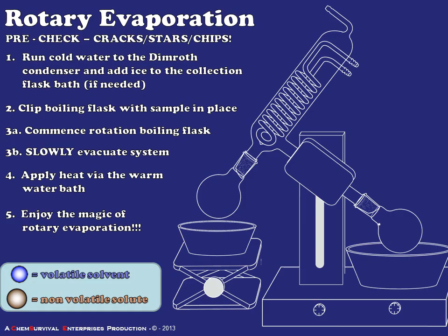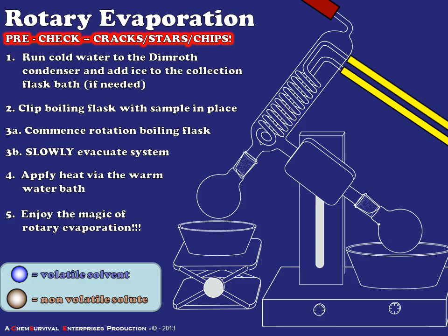Now that we're familiar with the rotary evaporator, let's talk about how we're going to use it. Vacuum and water lines are commonly pre-attached, since most rotary evaporators are very large and tend to have dedicated lines — but if not, you'll need to apply those yourself. Before we start anything, we're going to inspect all the glassware we'll be using, including the condenser, the solvent trap, the boiling flask, and the stem of the rotation unit.